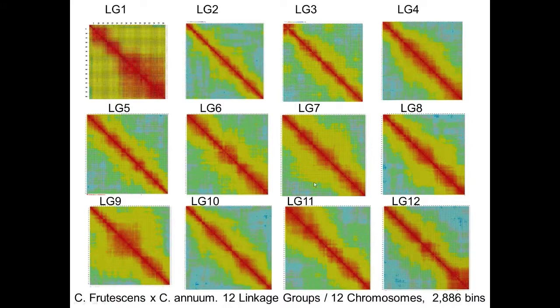And so we did that, and again, we've minimized. We don't really have any of these glaring breakpoints in this genetic map, and we're really quite pleased with this genetic order. And we verified this genetic order in JoinMap, and we got basically the same results.